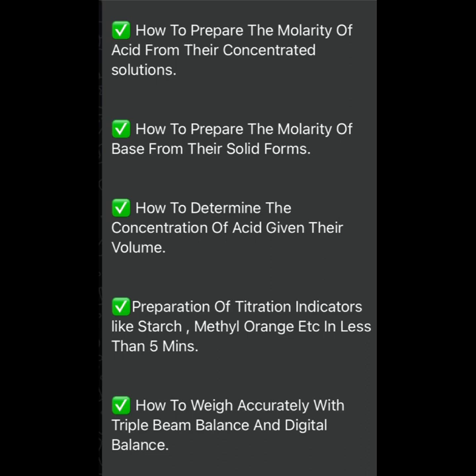It is a practical video where all those things are demonstrated. The aim is for us to grow together and learn together. You will be learning how to prepare molarity of acid and base, measure accurately, and prepare different indicators for titration. The accuracy of all these things matters in our practicals, because when you prepare these things wrongly, the end point will not be correct.